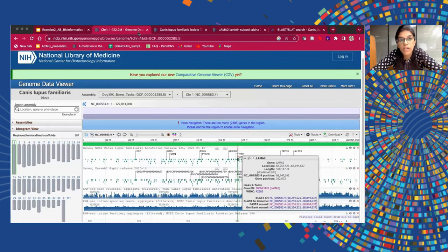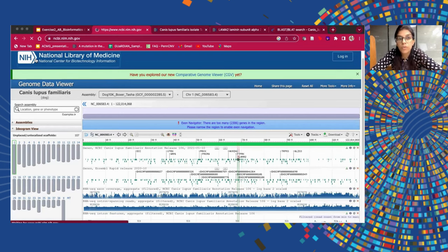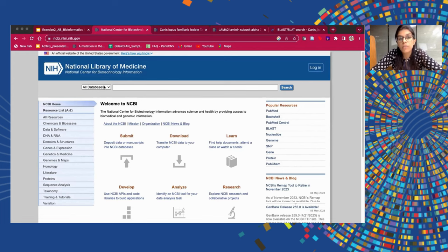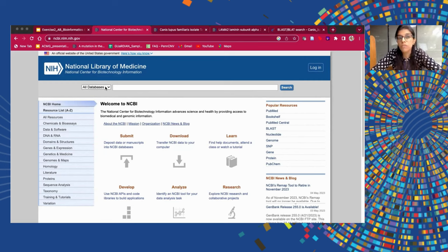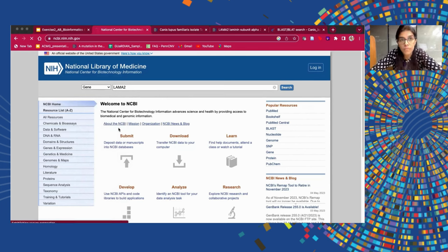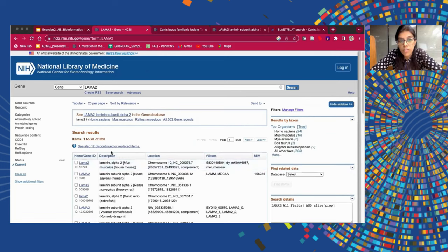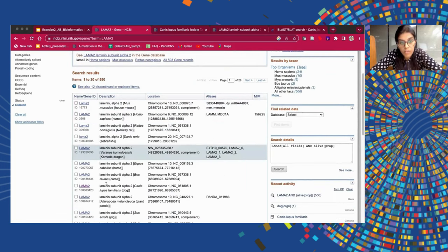Alternatively, let's say you already know that LAMA2 is the gene you want to work on and you know it belongs to the dog organism, but you don't know on which chromosome it is. Instead of going chromosome-wise to find your gene, you could directly go to the gene sub-database of the NCBI browser and type in your gene name. Once you type in your gene name and press search, the tab will open showing all the genes present in different organisms. Since our organism of interest is Canis lupus familiaris, we select that particular entry.